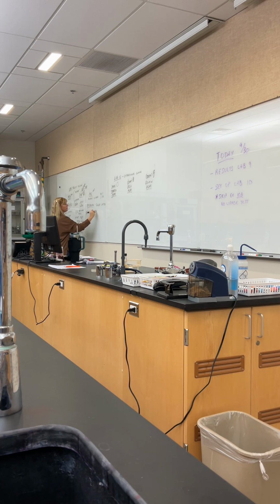You know what, I just realized I have to fix this. This should be phenol red. Sorry, guys. All of a sudden I'm like, wait a minute. If it's neutral red over there, that has to be phenol red there. Okay, so the pH indicator here is phenol red, and the pH indicator here is neutral red.